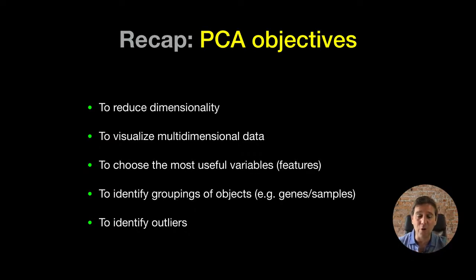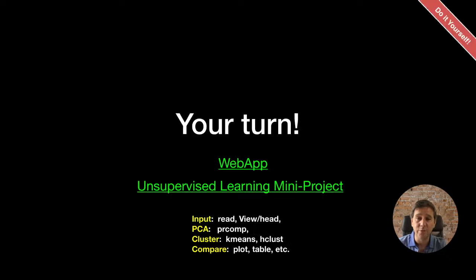Is it something that went wrong with the experiment that one time? Is it an outlier? Why is it an outlier? Or maybe it's a very interesting thing in its own right that tells us something very important. It's up to us to figure that out, and we'll use methods like these to figure that out, principal component analysis.